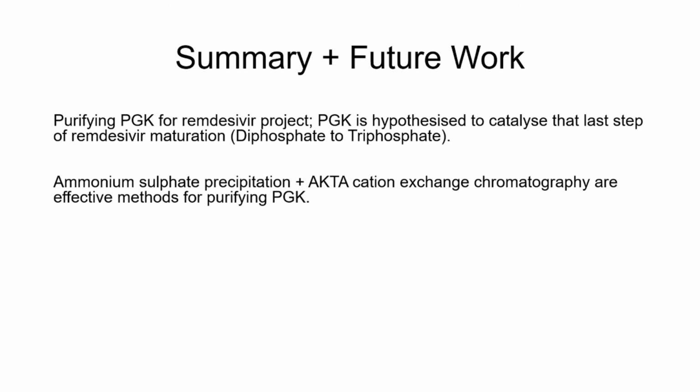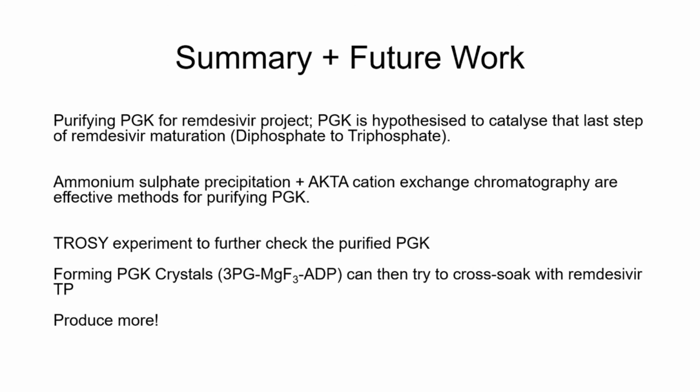So just as a summary, the main reason I've been purifying PGK is for the remdesivir project. PGK is thought to catalyze the last, fourth step in the maturation of remdesivir, and ammonium sulfate precipitation and ÄKTA cation exchange chromatography are effective methods for purifying PGK. As for more work in the near future, we're planning to run a TROSY experiment to check the purified PGK sample, and we'll hopefully be forming some PGK crystals to try and cross-soak with remdesivir. And finally, of course, I'll be producing even more PGK, and that is for a different project.